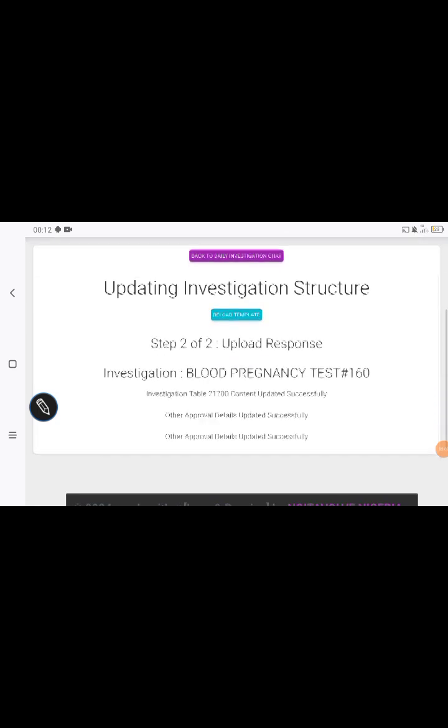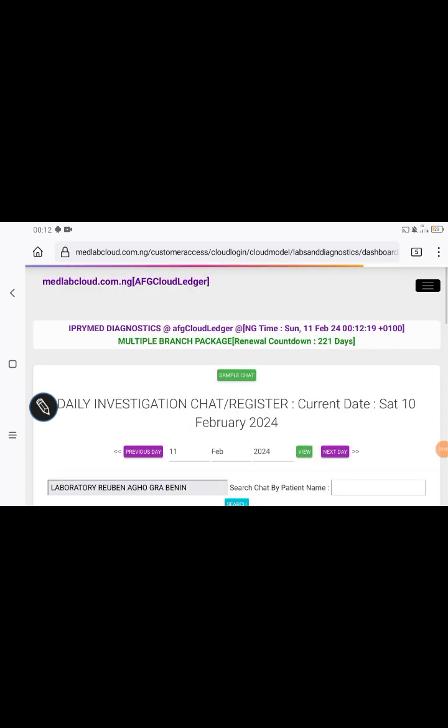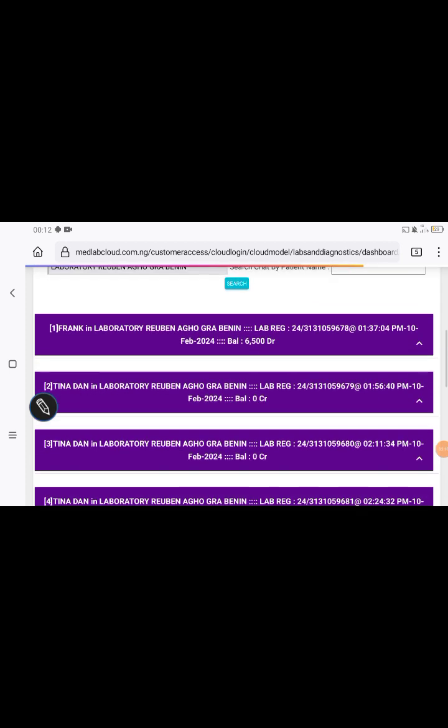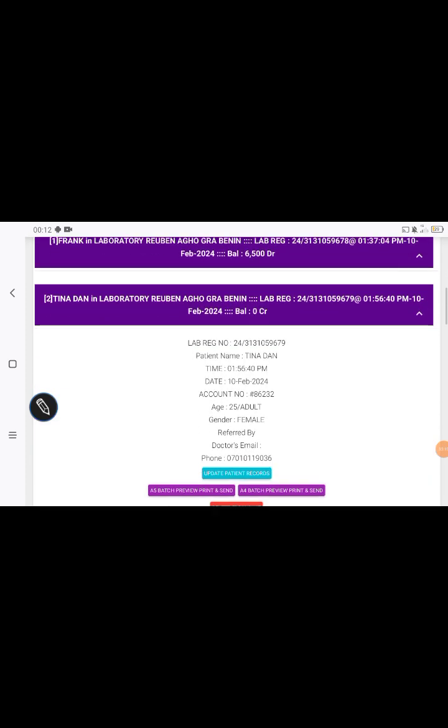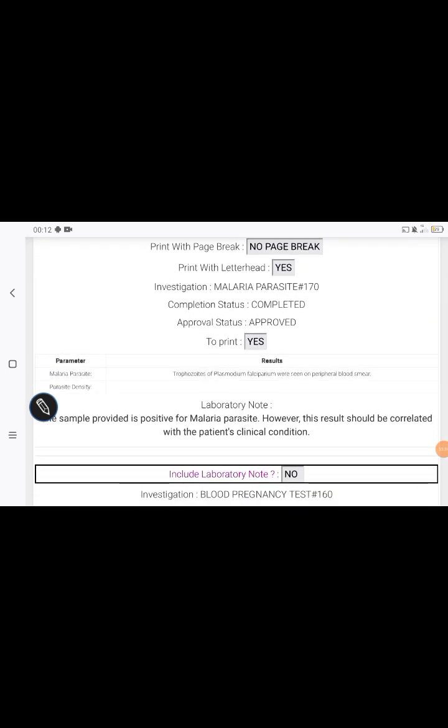Okay, so here we go. It's ready now. We'll click on this purple button, back to daily investigation. Now we want to go and see how this result looks. So we'll come to Tina Dan. Let's see it on A5 batch preview mode. Okay, so here we go. This is the result.